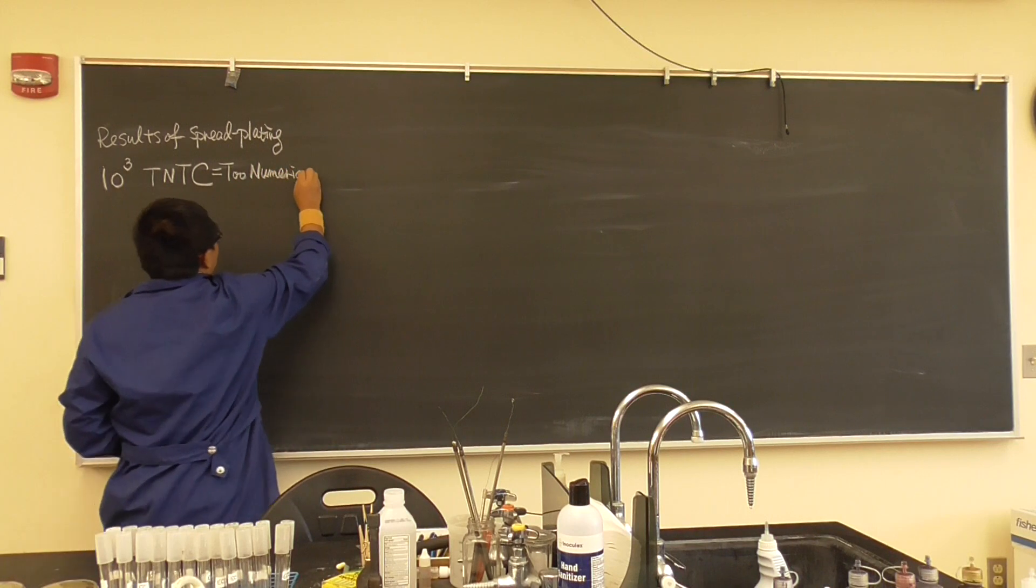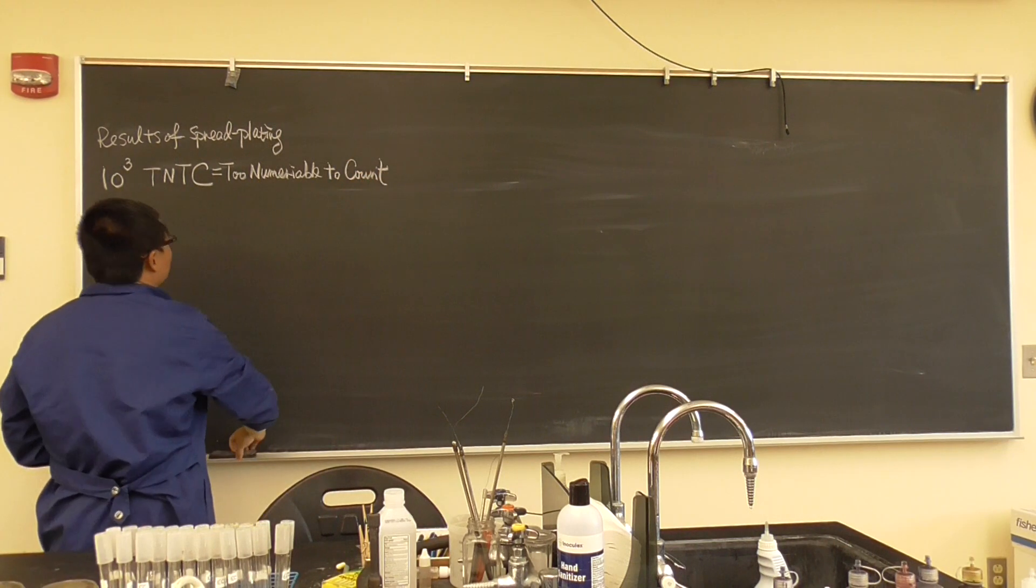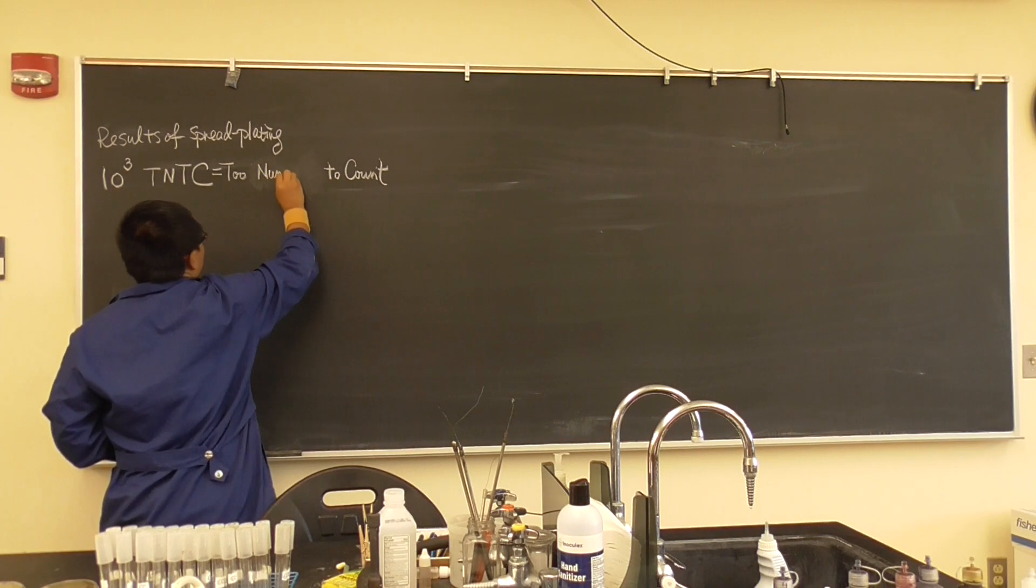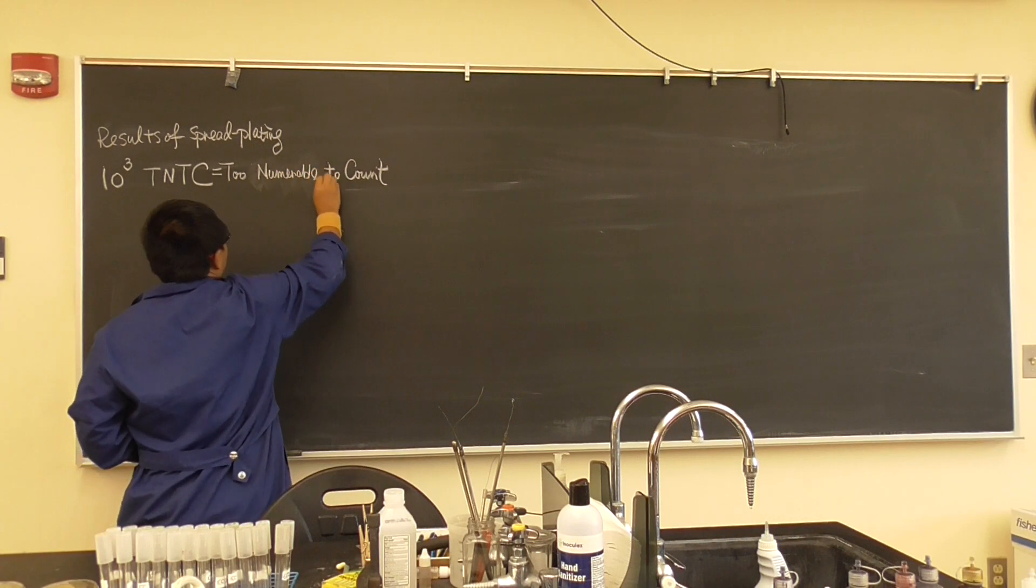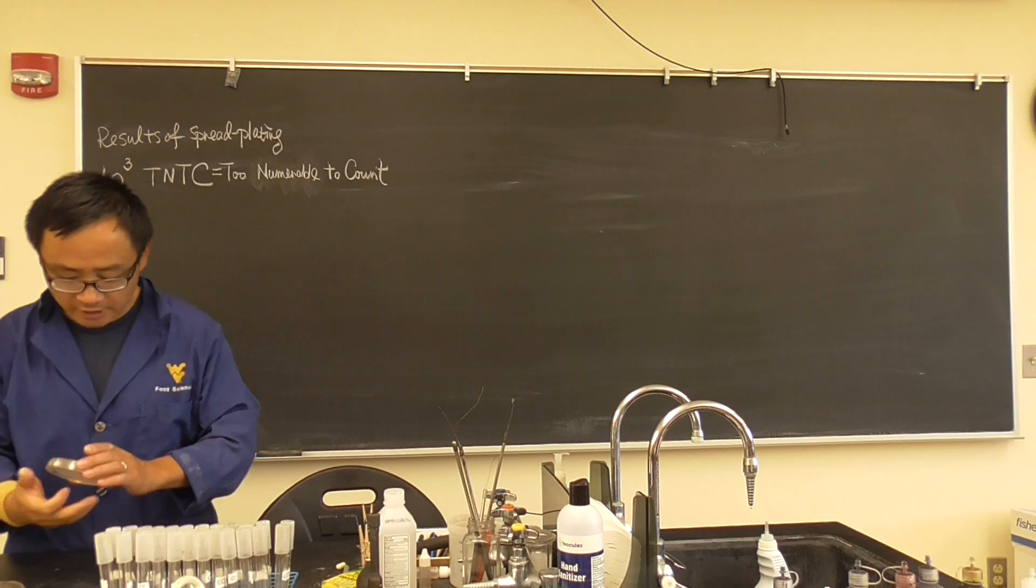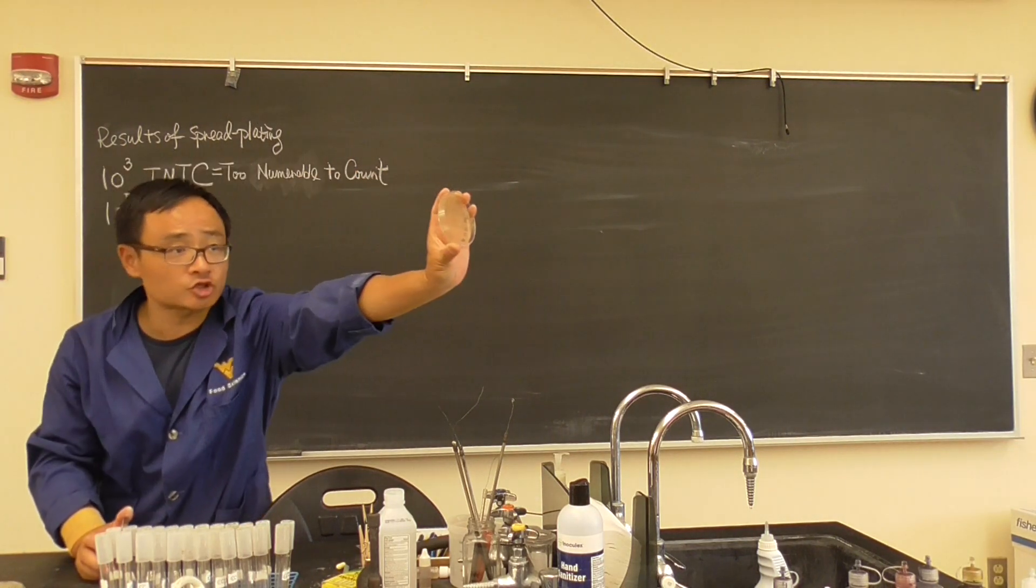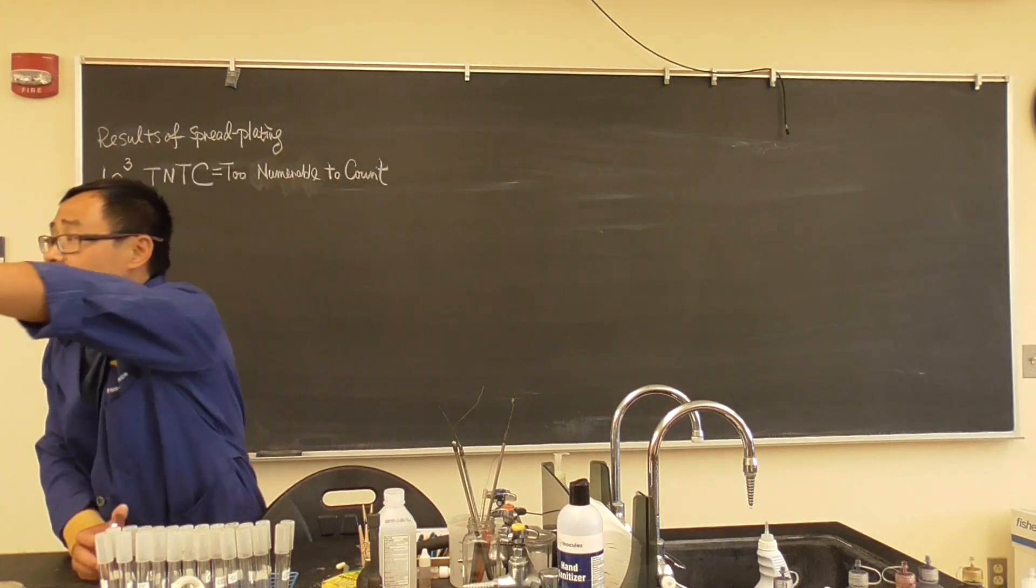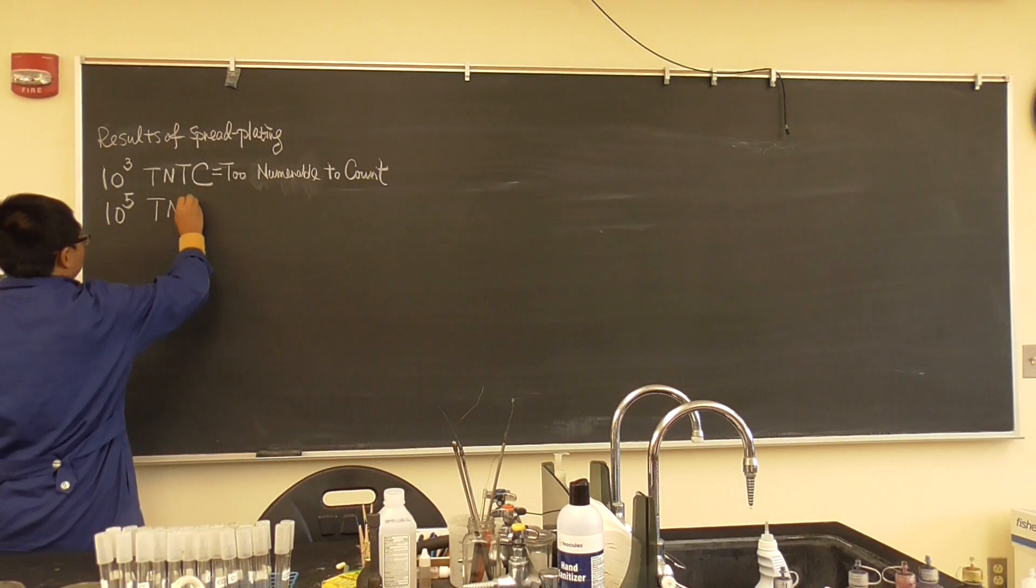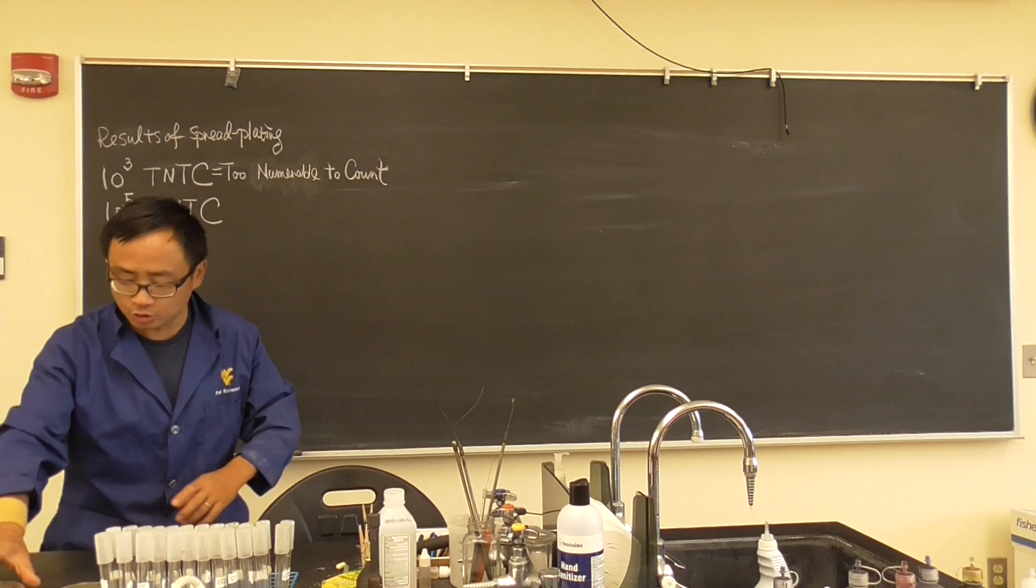You cannot even see individual colonies. So what we said, TNTC, indicates too numerous to count. You can just say too much to count, too numerous to count. Let's look at 10 to the 5. What does it look like? Something like this. You can see individual colonies start to show up. Is that still too many? Yes, it's still too many. So that is again TNTC.